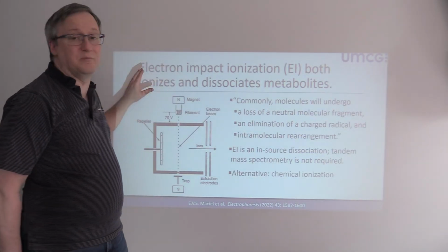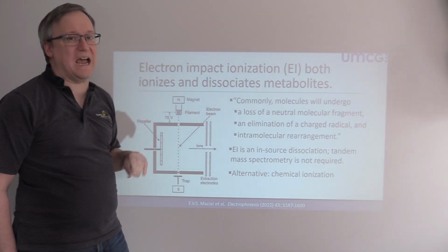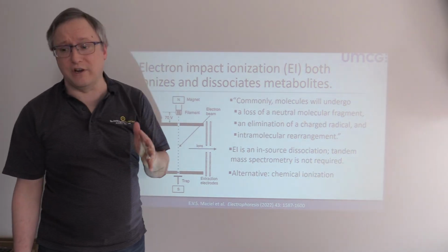All right. So this brings us to electron impact ionization, or sometimes just electron ionization.